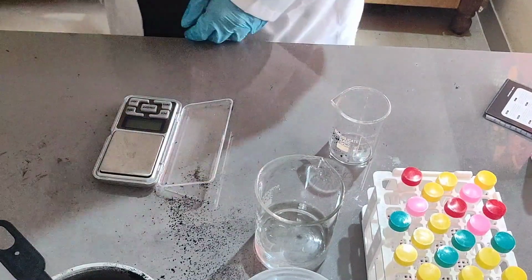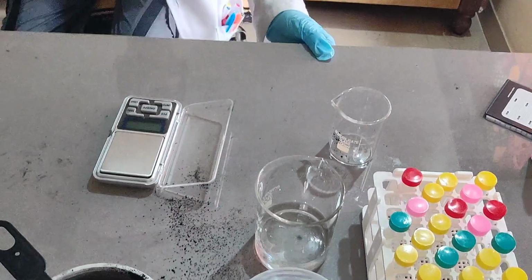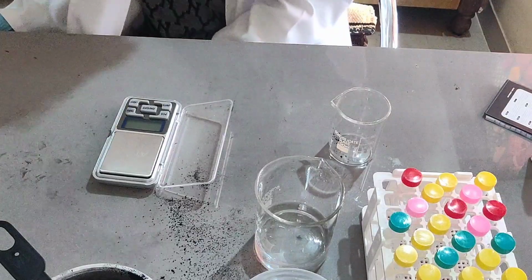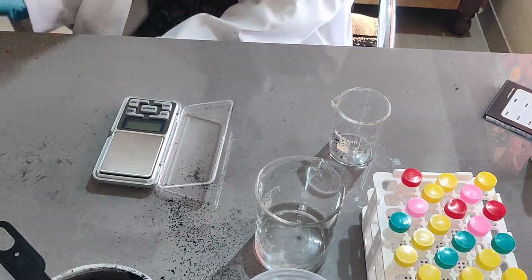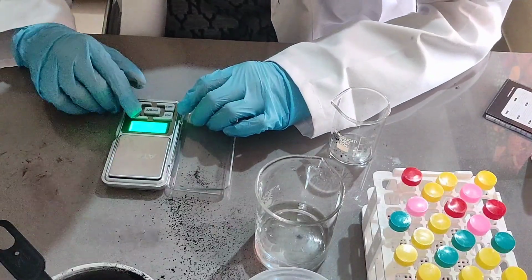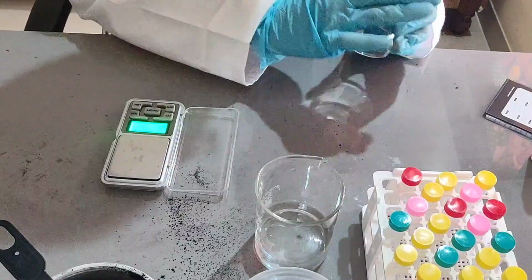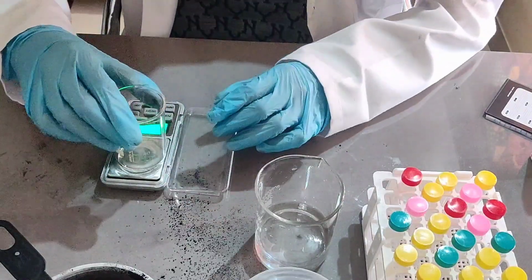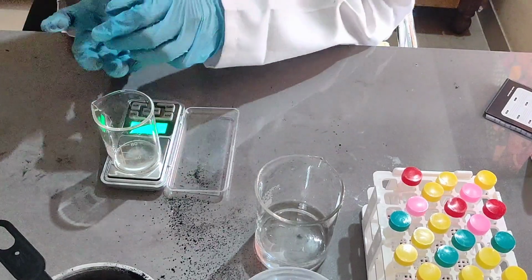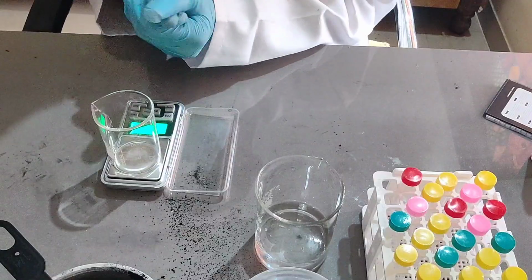After we are done with the experiments, I would clean each and every part that's seen by graphite once more, because you can just really tell apart if the thing is slightly tinted by graphite or not. This whole thing is 52 grams, by the way. Like the beaker. For anyone who's interested.